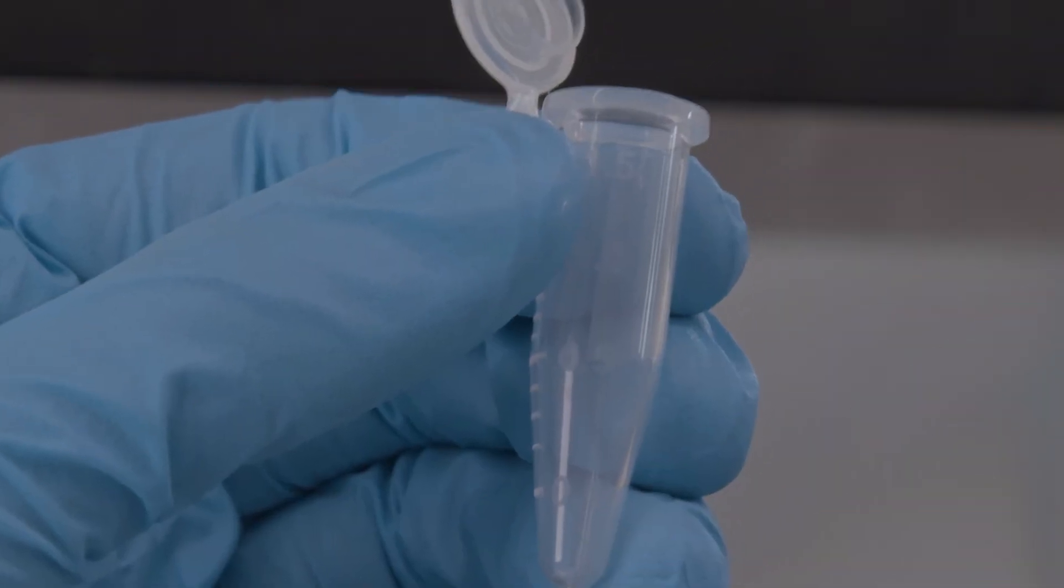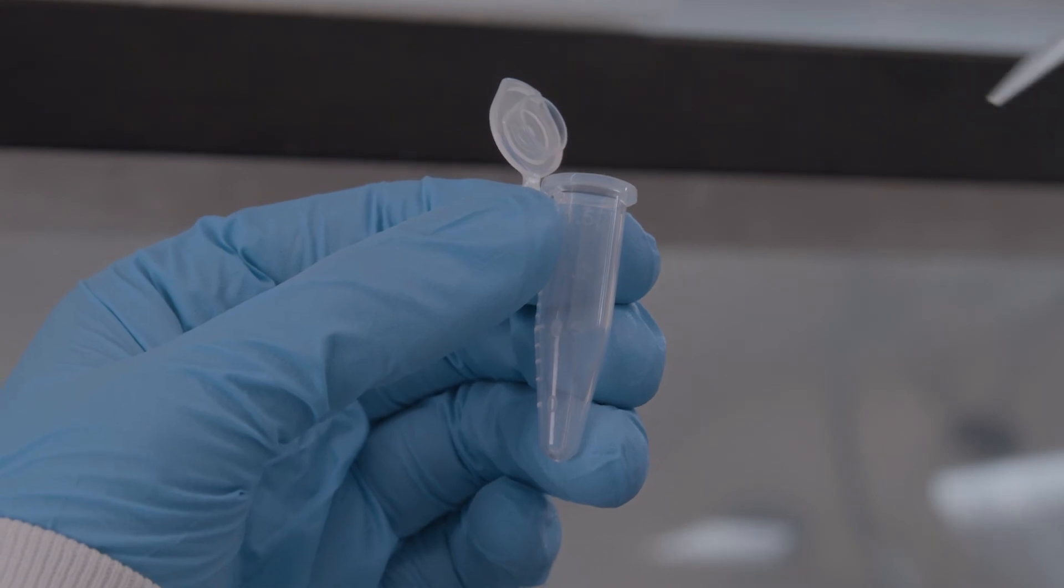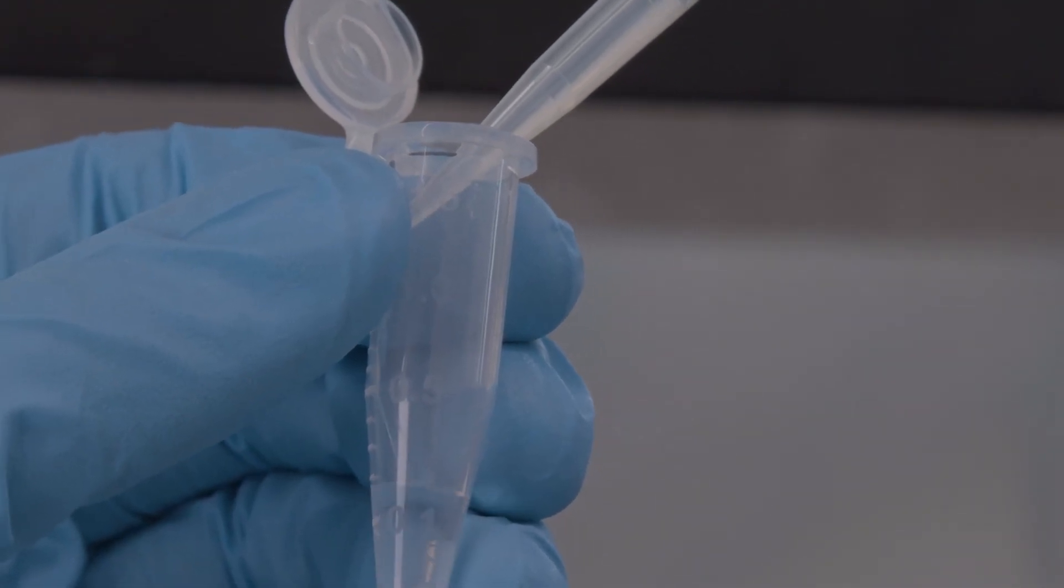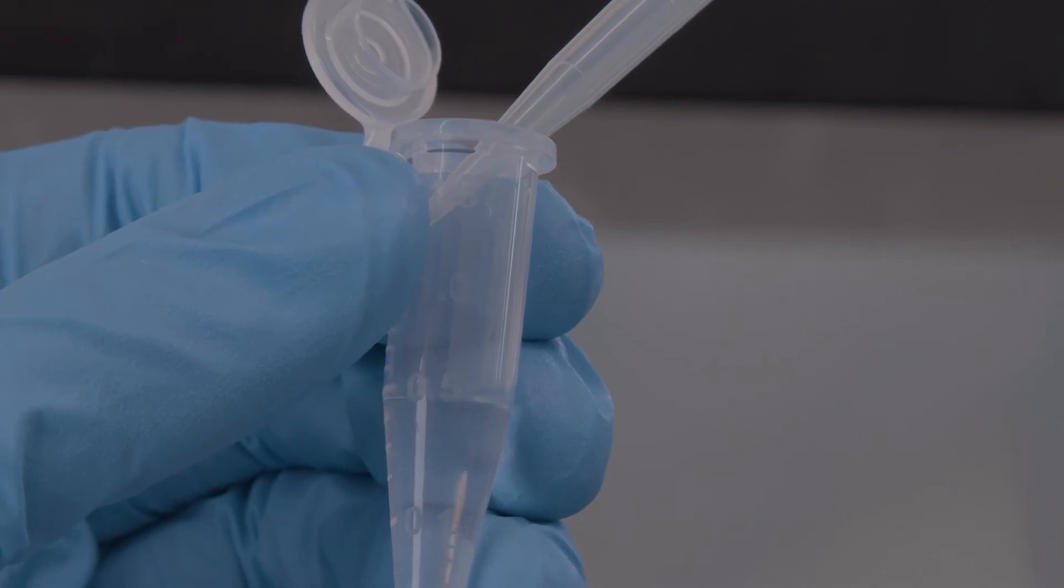If this is a new container, place the tip lightly against the side of the tube. Capillary action between the side of the tube and the liquid will help draw all of the liquid out of the tip.